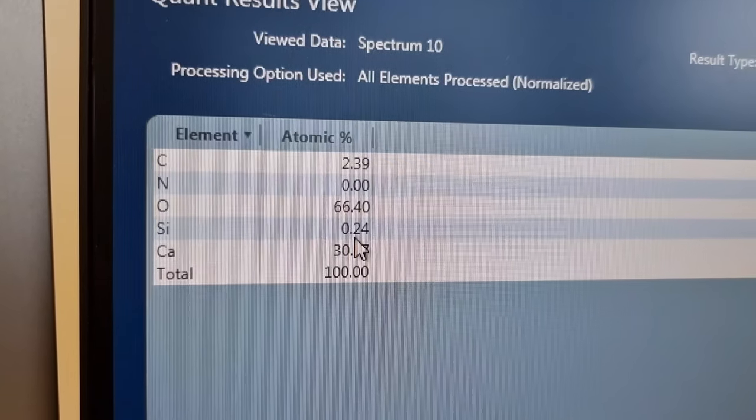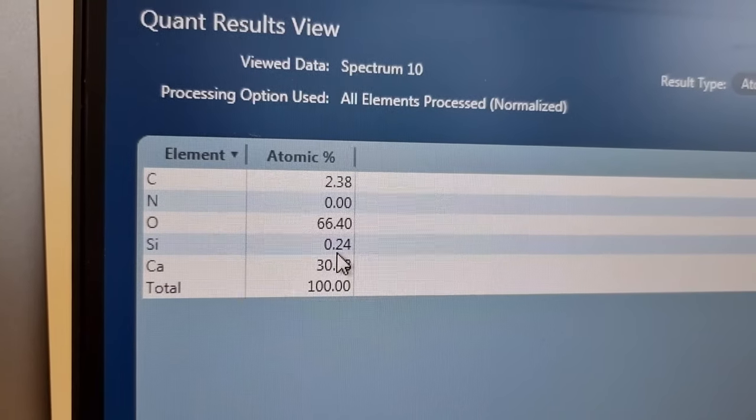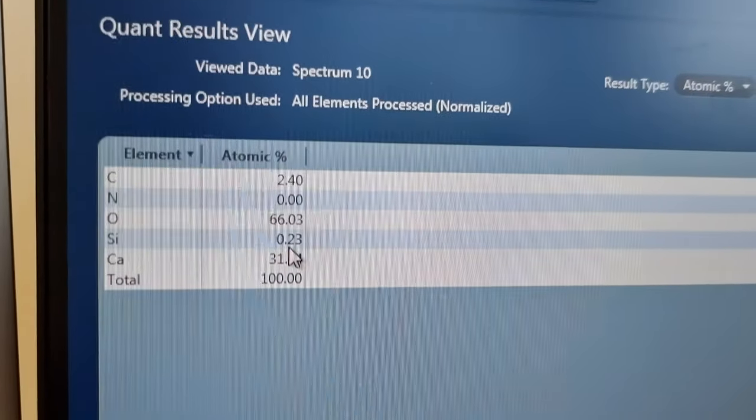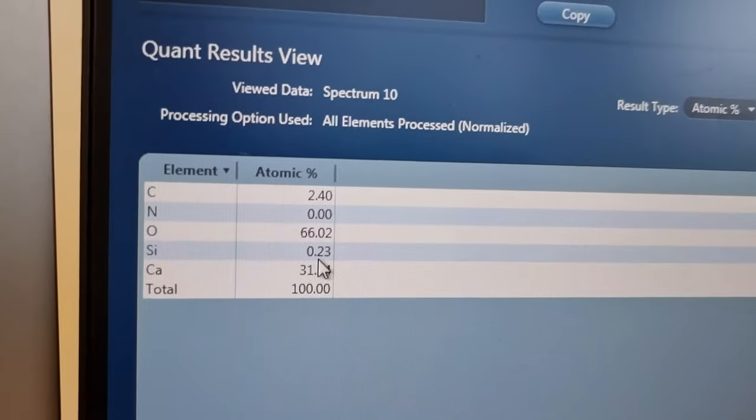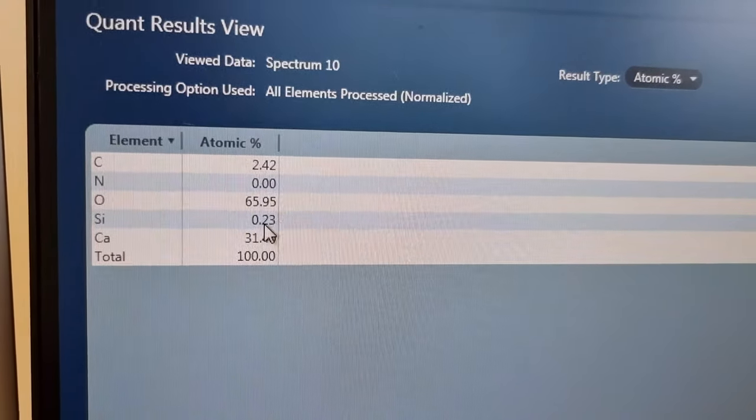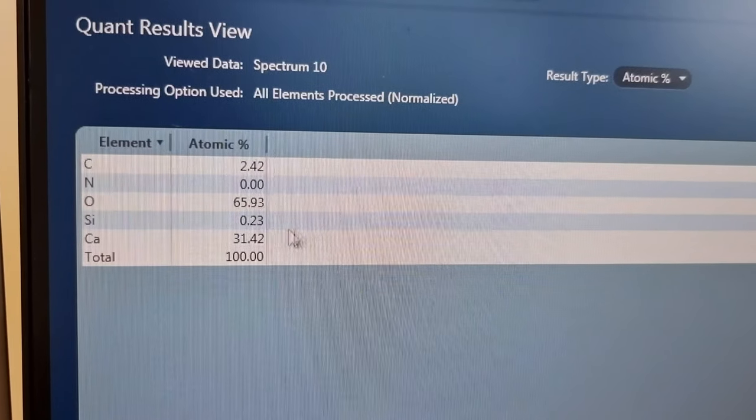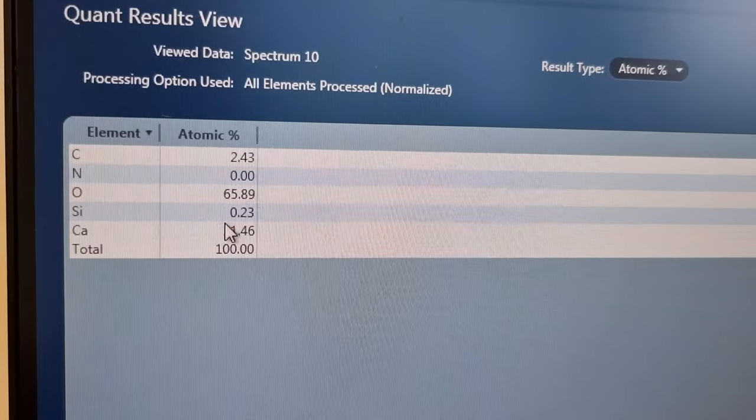Interestingly, it only seems to have silicon on some of the radial lines. We're going to go in and have a closer look to see if there is a different composition as we go through the radial lines. There it is — but it's only 0.24 percent here.